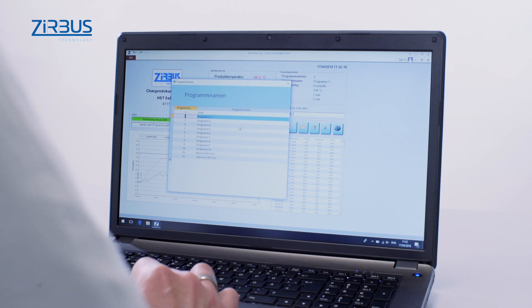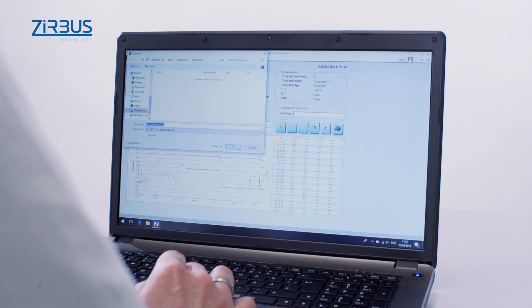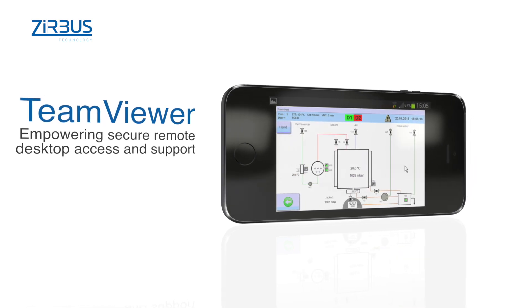At the same time, batch reports are documented to provide a detailed analysis of the sequence of steps, and these can be exported as either PDF or CSV files. In addition, TeamViewer allows users to monitor processes from their phone.